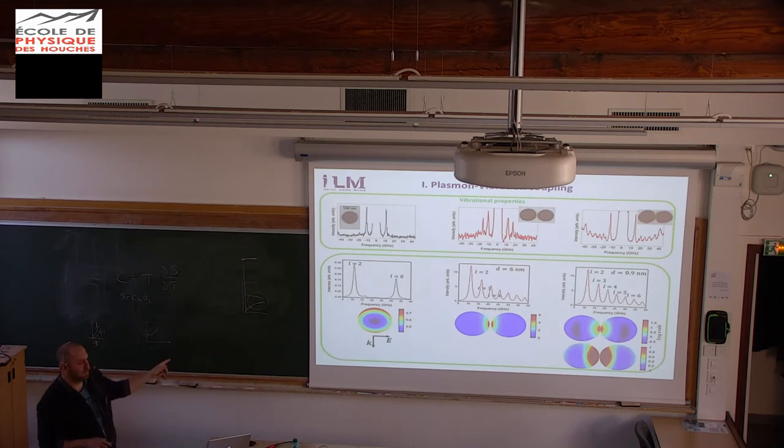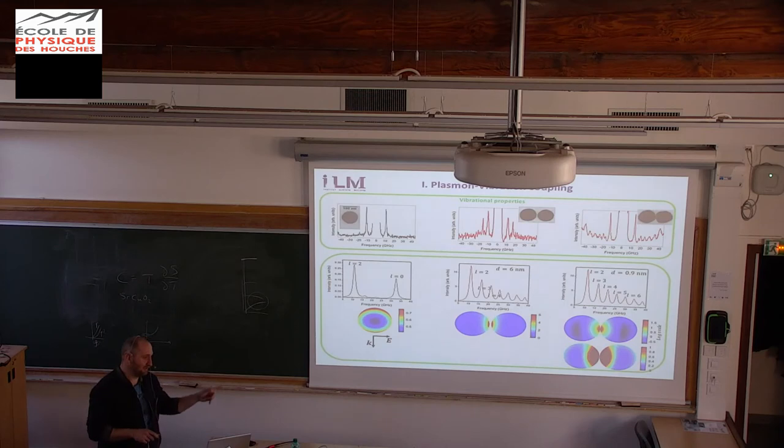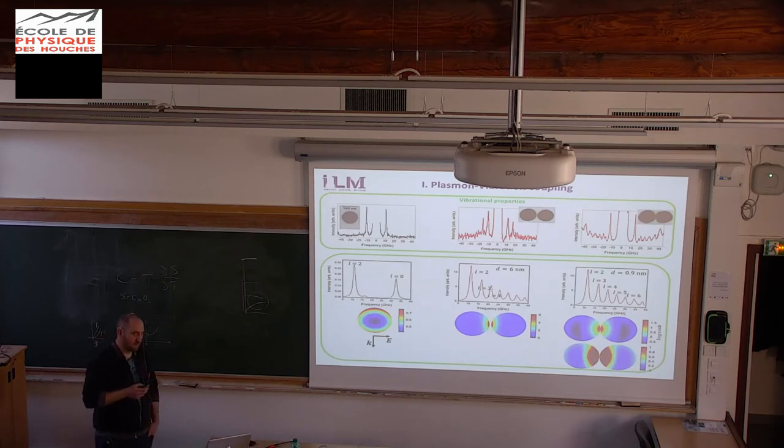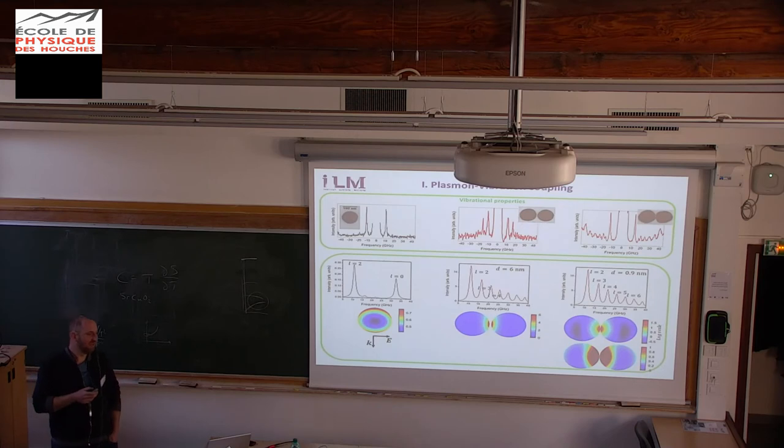Yes, it's right. But with this spectrometer, you will not change the wavelengths as you want, because you need a really good laser and your window is really sharp. But indeed, if we could easily change the wavelengths, this is something that we have to do: scanning over the wavelengths to see what happens on these overtones here. Quadrupole and more in Raman, yes, okay.